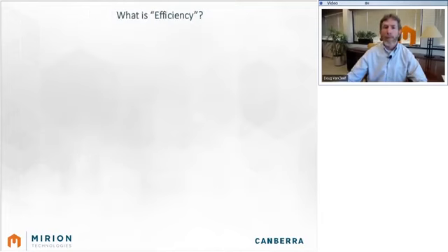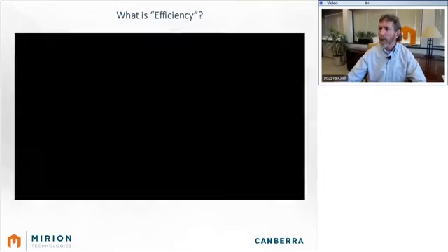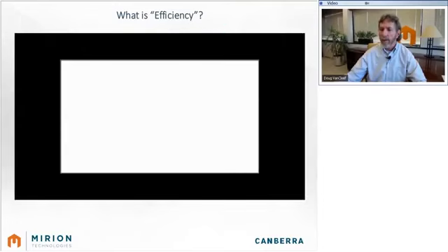Now on to efficiency. To introduce this topic, I'm going to play a short excerpt from our online self-paced Fundamentals of Gamma Spectroscopy training course. Then we will discuss a few of the important points about efficiency calibrations. And I told you I'm going to play a video. That presumes that I remain smarter than the technology, and we'll know that in just a minute.